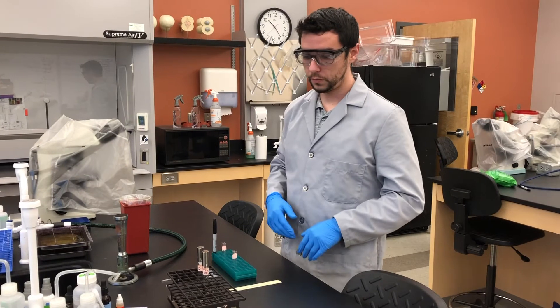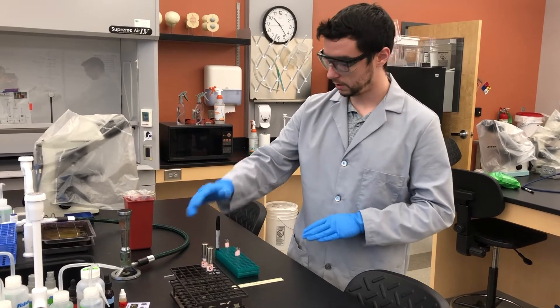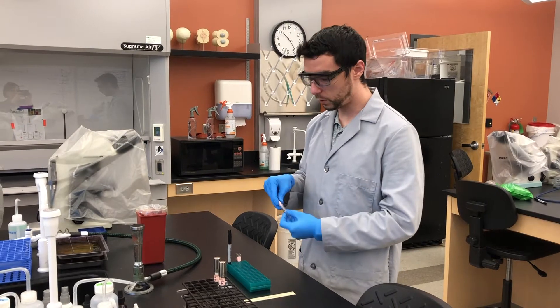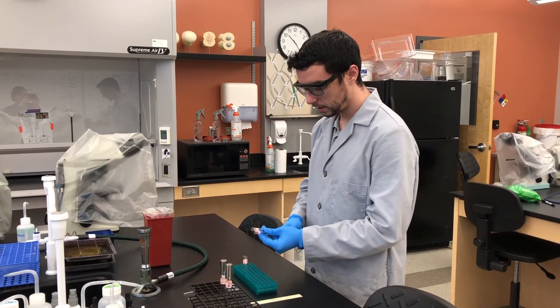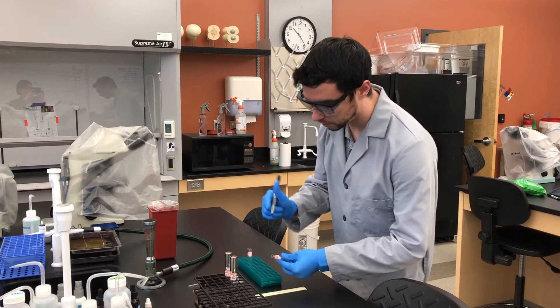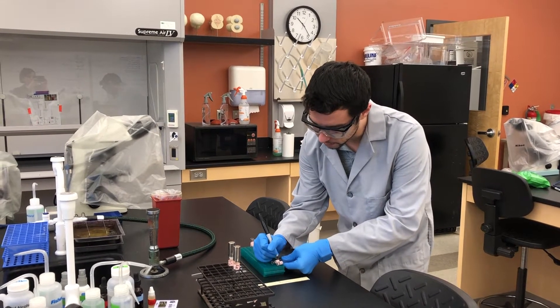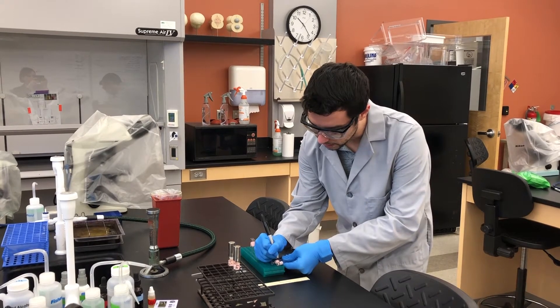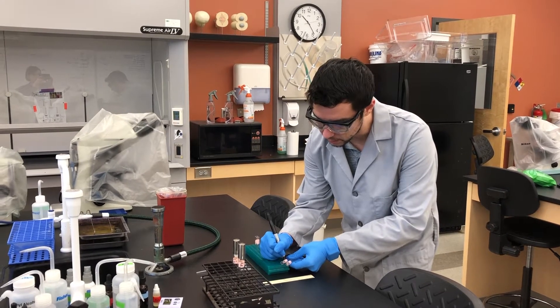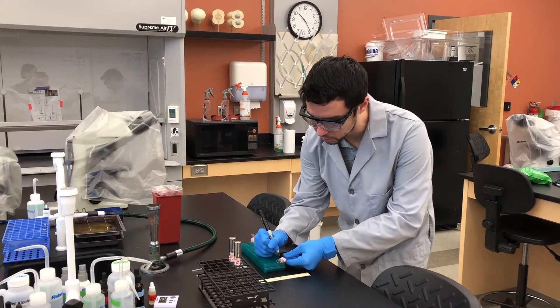We are going to transfer some growth cultures over to small tubes. Before we do that, make sure they are labeled and ready. We are going to label them based on the test. The first set of labels we will give is EA MR — EA for the methyl red test — and then EA VP, EA for the Voges-Proskauer test.